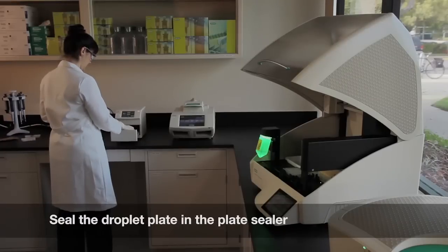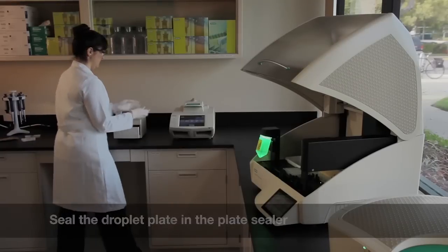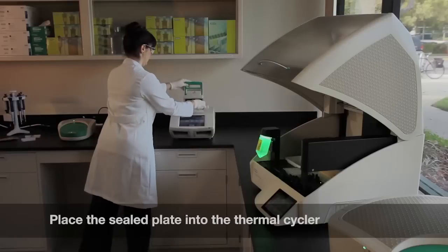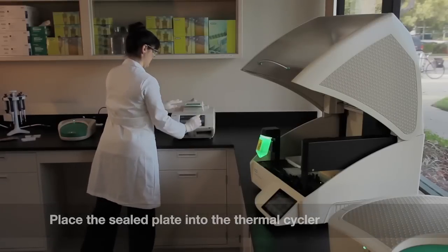Place the sealed droplet plate into a thermal cycler for the amplification step of the droplet digital PCR workflow.